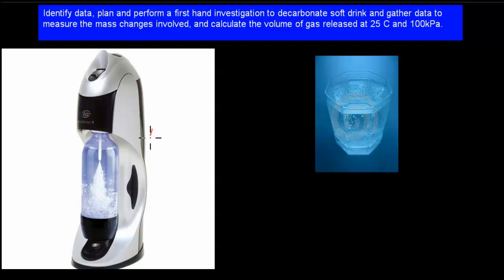If you make soda water, what you do is you tend to pour in or put under high pressure, put in lots of carbon dioxide. This is how we make soda water. We've got our regular water here, and we've got this high pressure device which puts in carbon dioxide. These bubbles are carbon dioxide.